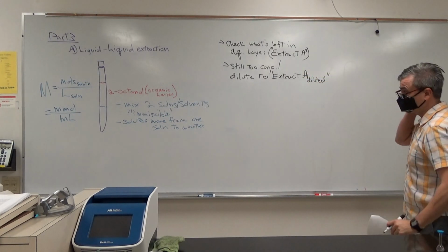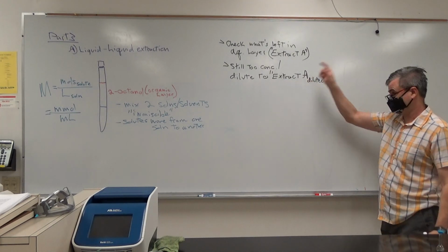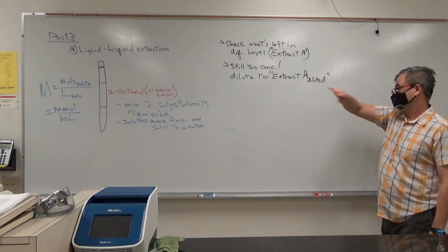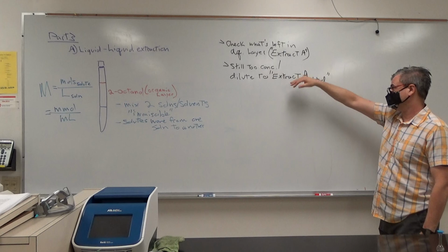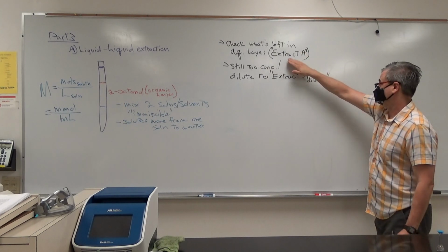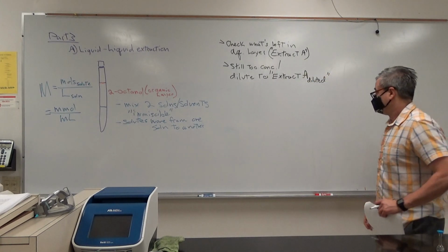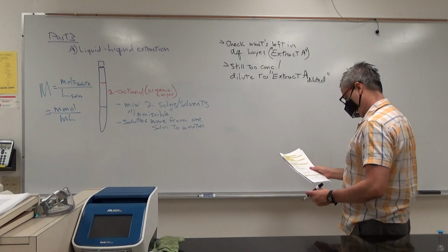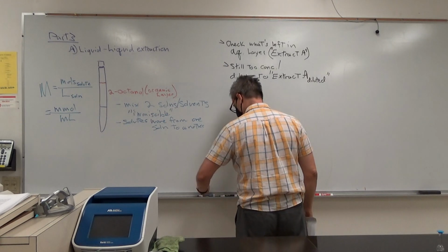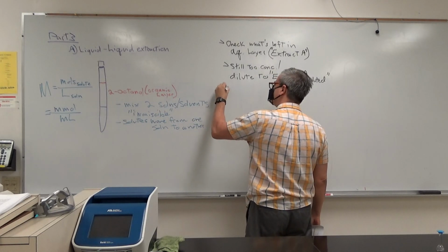Just as we did in part 2, we can figure out the concentration. Now we can measure the absorbance for that. Then we can figure out the concentration of this. But that's not what we want to know. We want to know that, but we can do this with math. Once we know the concentration of that, we can figure that out through math. Okay? All right. We will also want to know what's left, what's gone into the organic layer.